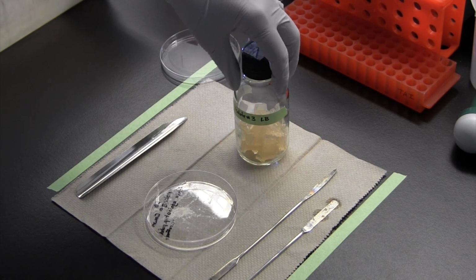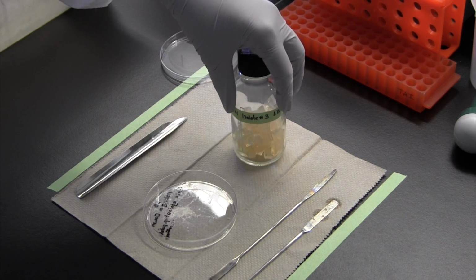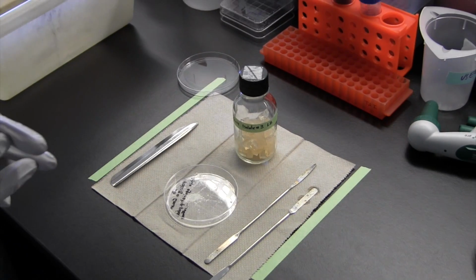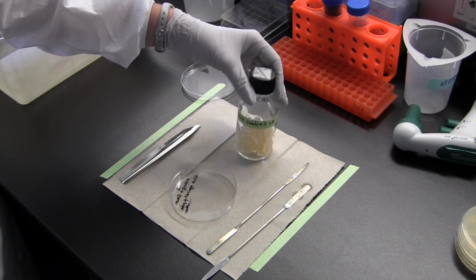So the next step of our chemical extraction is that we actually need to freeze what's in the bottle. And the reason that we're freezing what's in the bottle is to actually break down the agar a little bit, to lyse the cells, to make all of the material there that we were trying to extract more accessible to the chemical solvent. So however you can freeze it is going to be up to you and your schedule. If you have a -80, you can put the bottle in the -80 for 20 to 30 minutes, and that's going to work great.